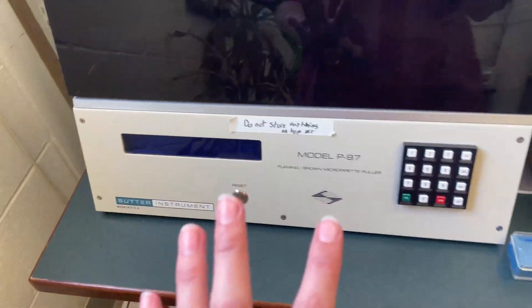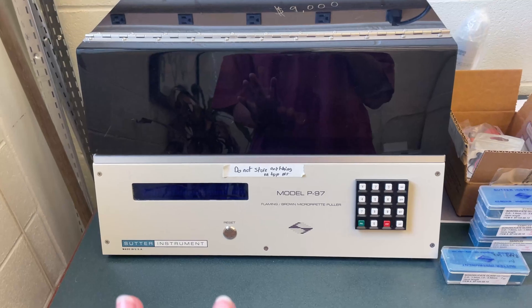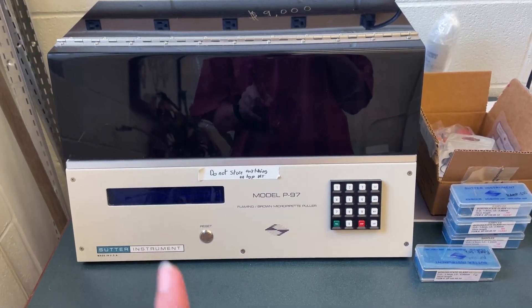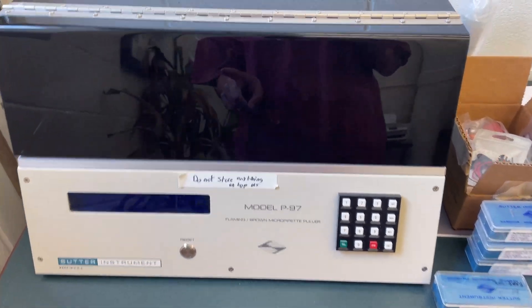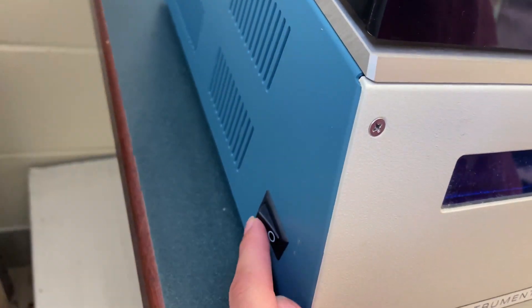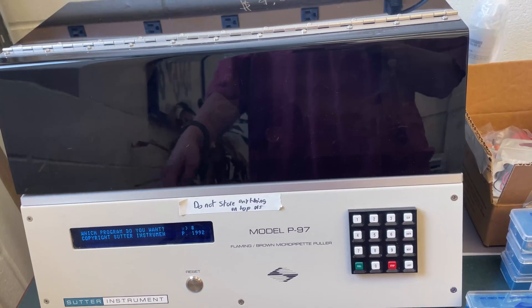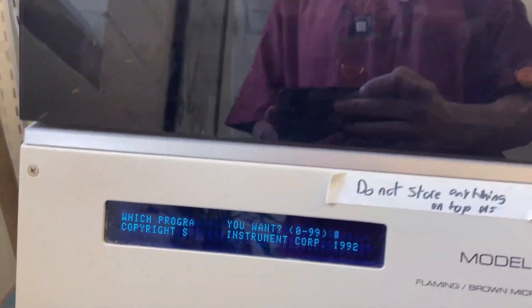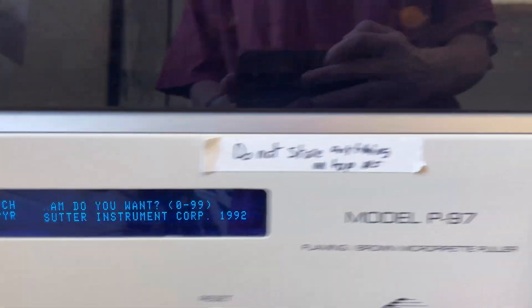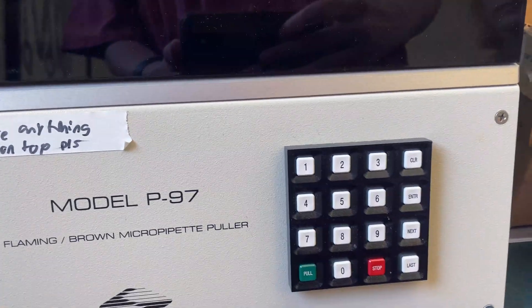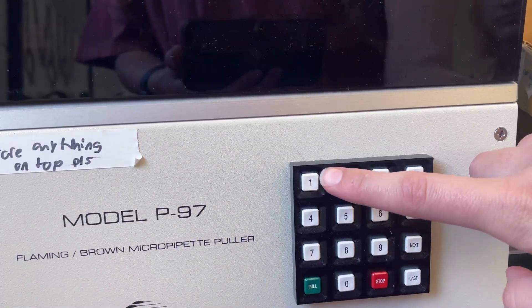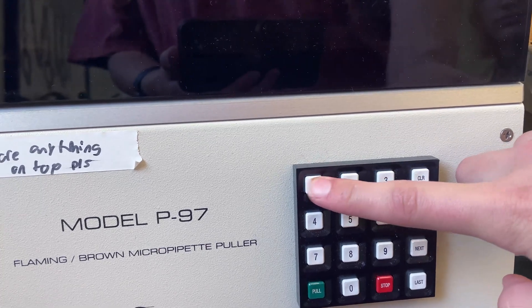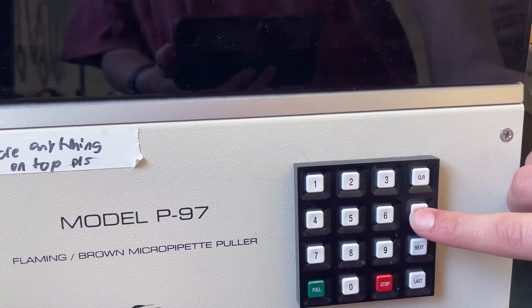Okay, so we are going to learn how to pull some needles for micro injections. First we're just going to turn it on, and then we are going to go to program one. So you just press one, enter.